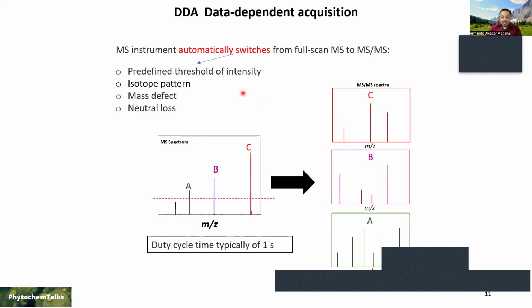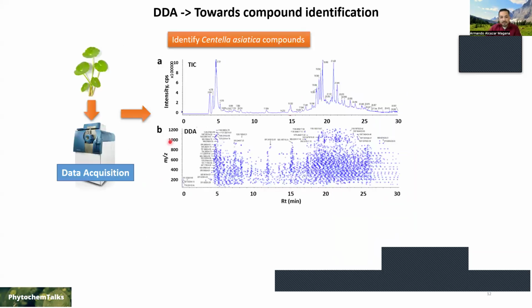That is basically the difference between the exact mass and the integer mass. I have a slide to explain that because it's a little complicated concept. And of course, for each one of these ions, we can get a peak. We can integrate the area under the peak to use it for quantification.